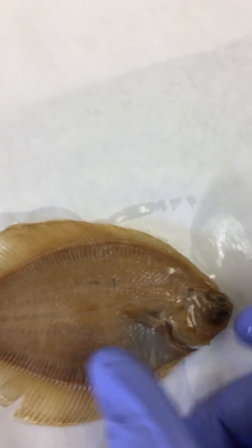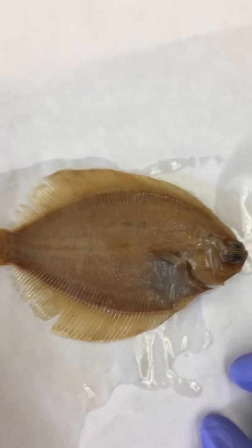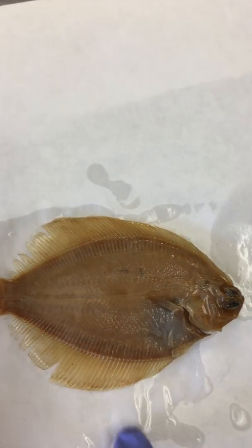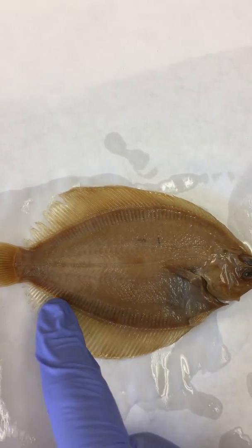We are looking at the side view of the fish. This is the dorsal side with the dorsal fin. This is the ventral side with the anal fin.